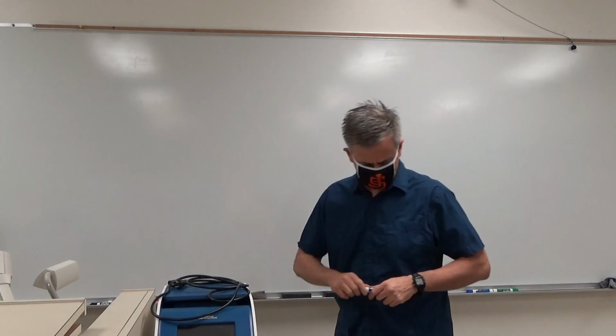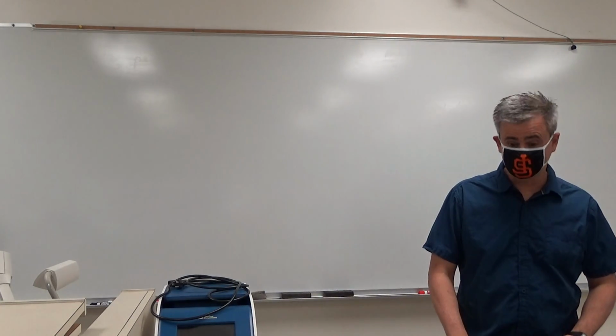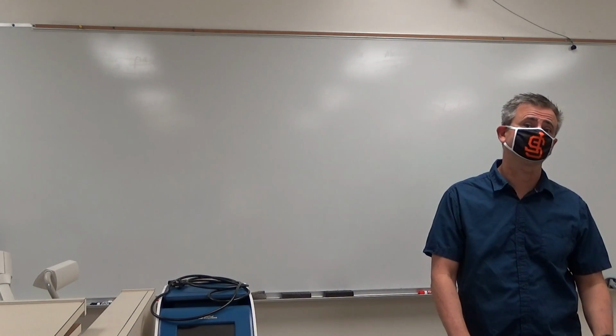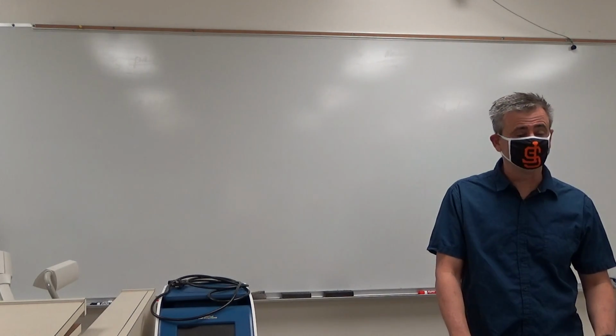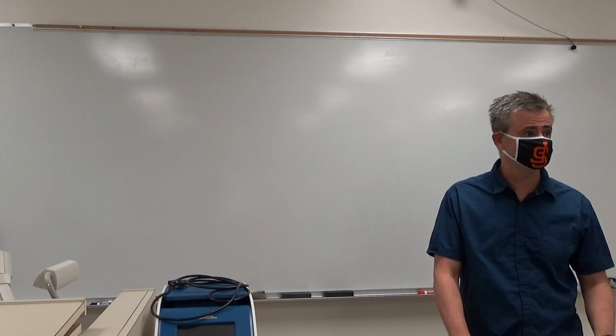Okay. So the goal for today is we want to figure out the ratio. That's the ultimate goal. We want to figure out the ratio of R to S. And not only that, but we want to figure out which one is dominant. Okay?